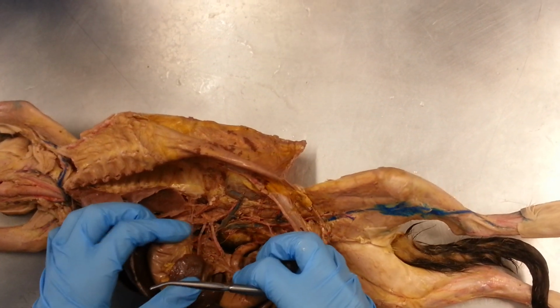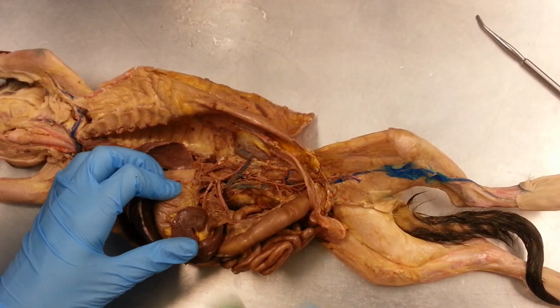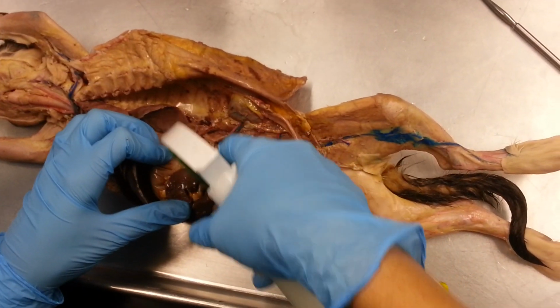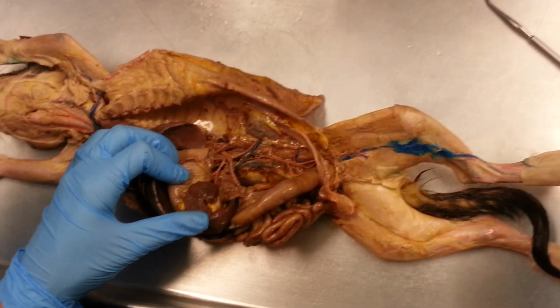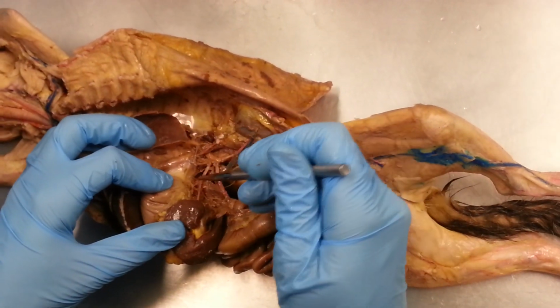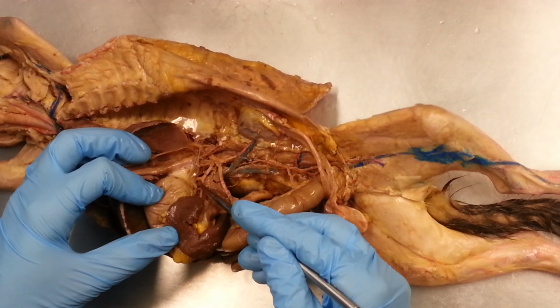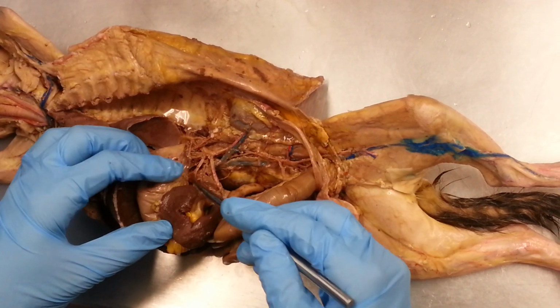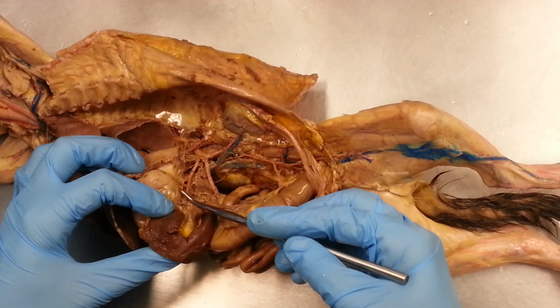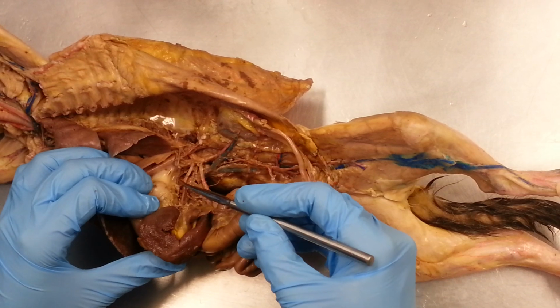My first split from the top of my abdominal aorta is the celiac trunk. The celiac trunk is going to give me a three-way split to my upper abdominal organs. The three-way split goes from the liver, and it's usually the first one is the liver or hepatic. Second one is usually the stomach or gastric. Third one is usually the spleen or splenic. Okay, we can see that there's an obvious three-way split.